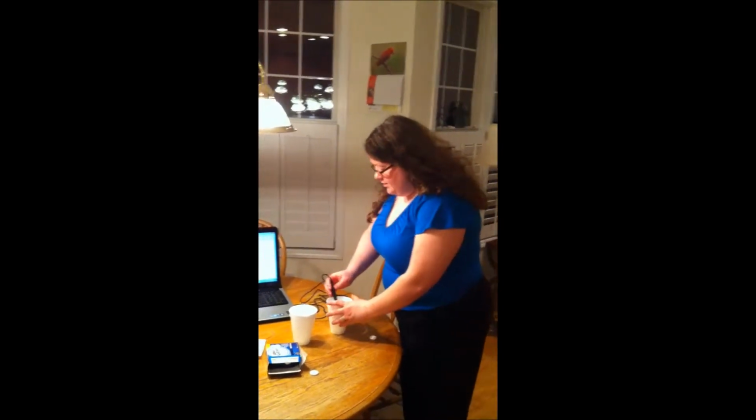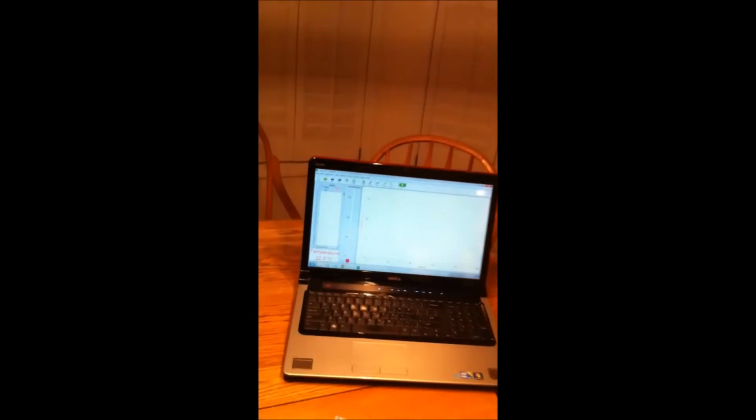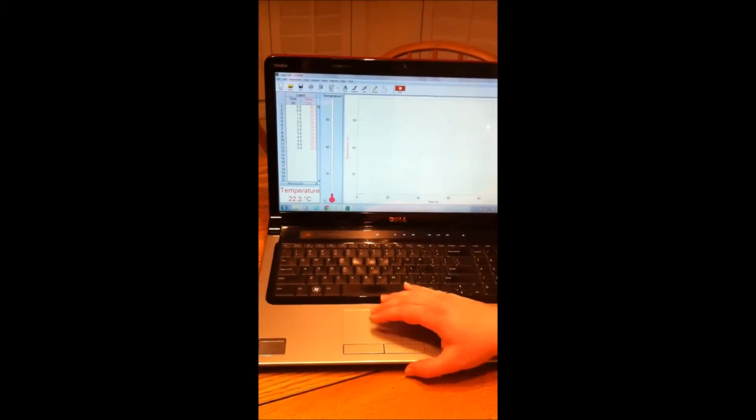All right, this is just our traditional trial one like you guys did yesterday in lab. It's 60 milliliters of room temperature water. And we're going to put the temperature probe in and see what the temperature is. What's the temperature of the room temperature water? Debbie? 22.3 degrees centigrade. Okay, great. All right, so I'm going to start collecting data and drop the tablet in. All right, let's change the scale so we can see the data.